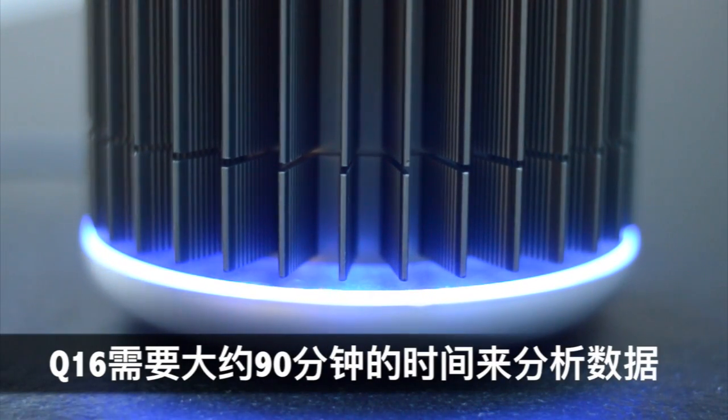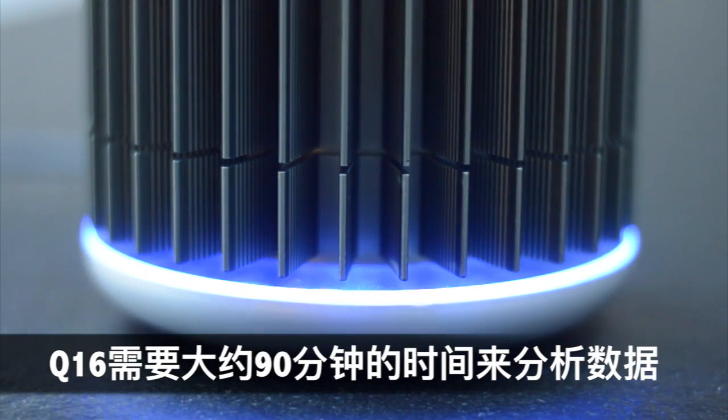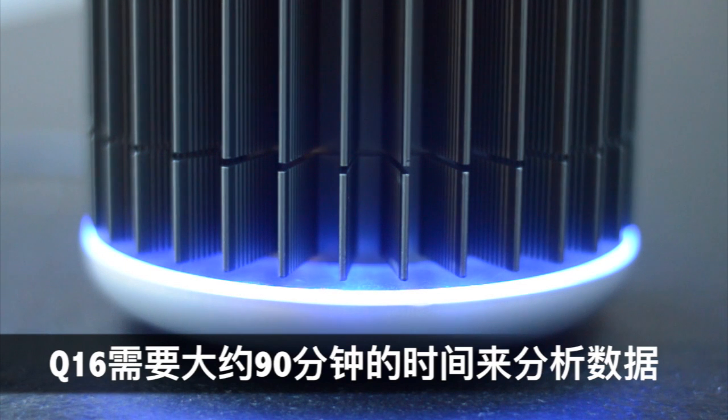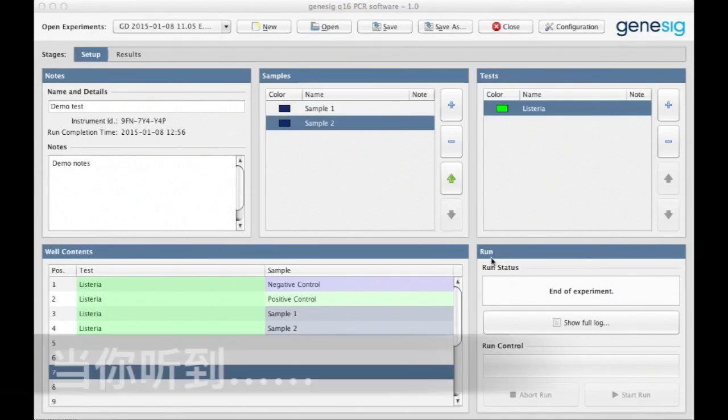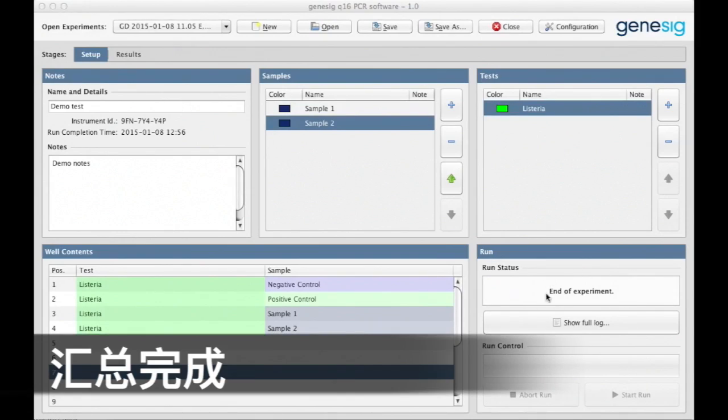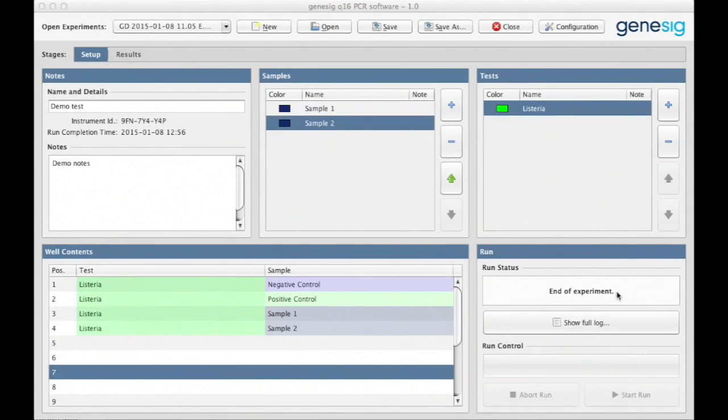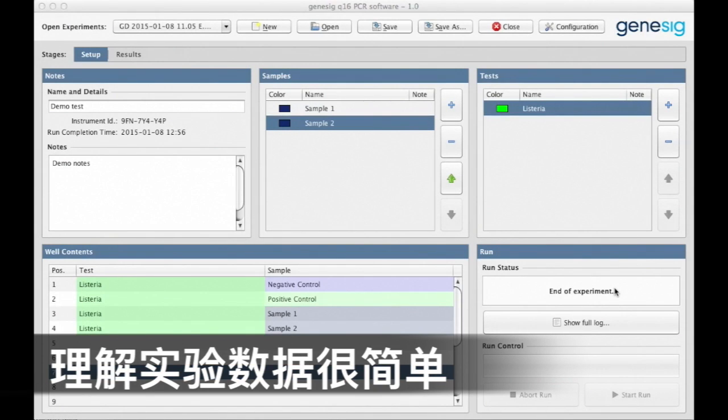It takes around 90 minutes for your GeneSig Q16 to analyze your data. Once you hear this, understanding the results is really easy.